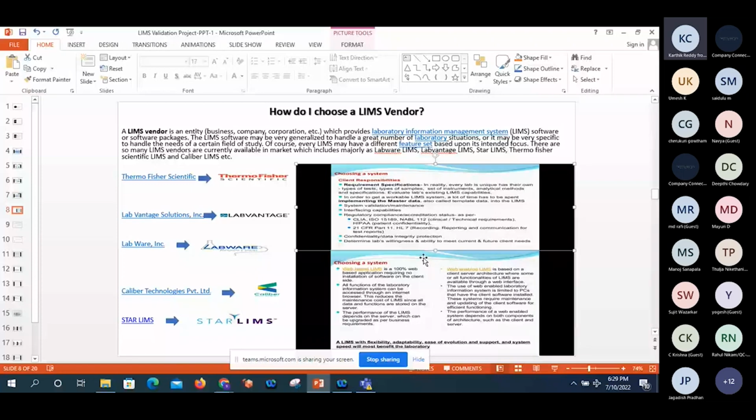There are two types of LIMS, a client-based application and a web-based application. Web-based means if the URL is available, the user interface is easily manageable. We can't install the LIMS application on each and every PC or laptop. It is a web-based, web-enabled LIMS.